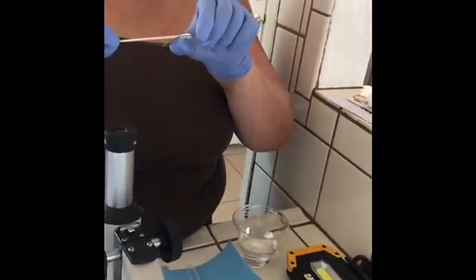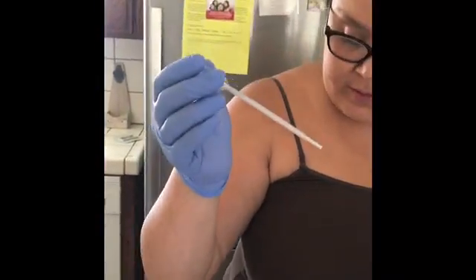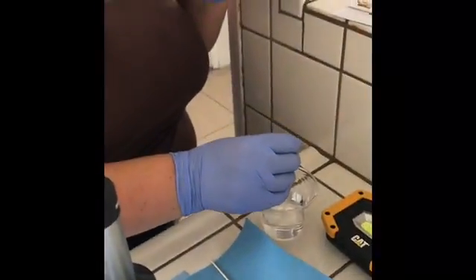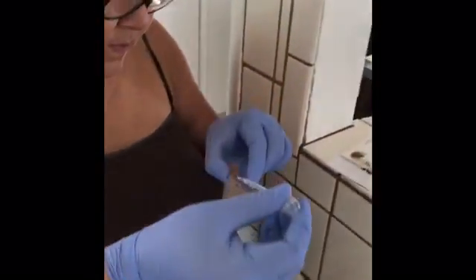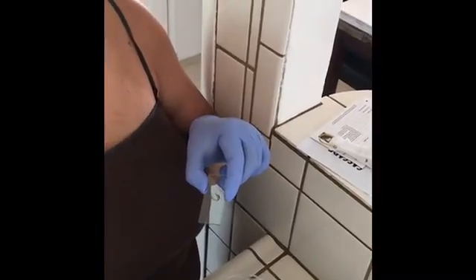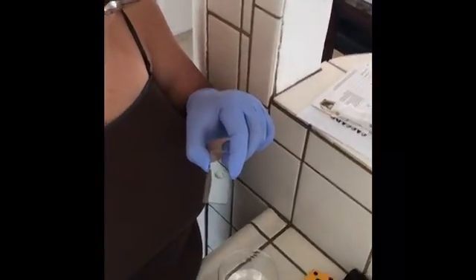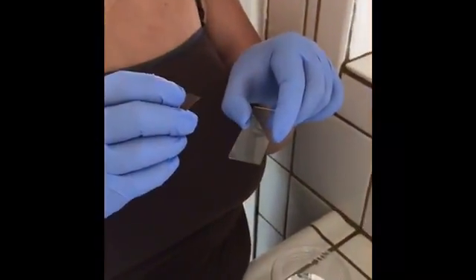I'm grabbing this. And then with my pipette, I'm going to add 1 drop of distilled water to the smear. There's 1 drop. Then with my cover slip, I am going to carefully place 1 edge of the cover slip next to the water drop on the slide.